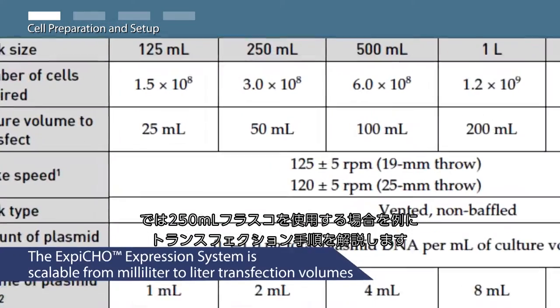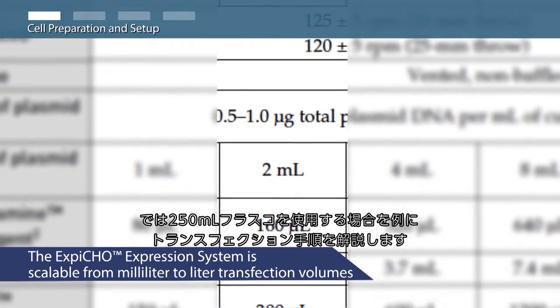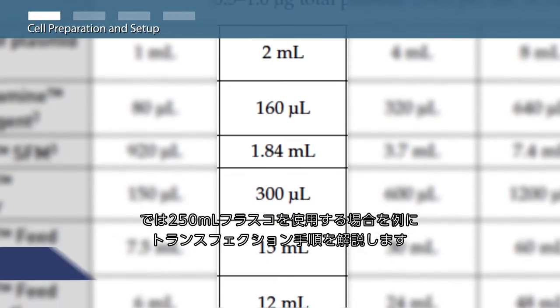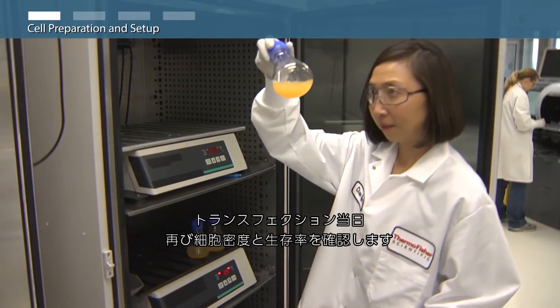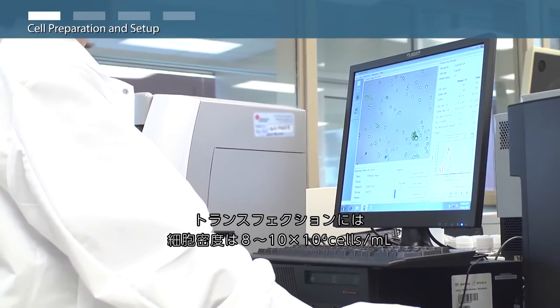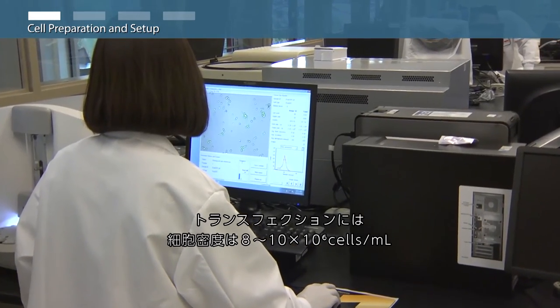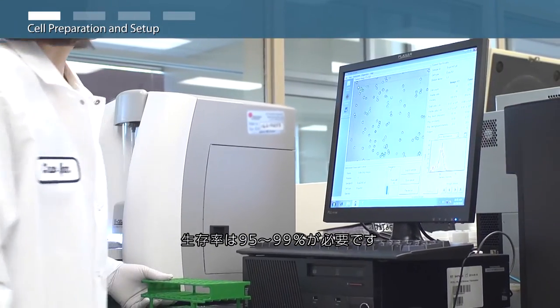We will follow the 250 milliliter flask format of the XBCHO expression system transfection protocol. On the day of transfection, reexamine cell density and viability. The cells should reach a density of 8 to 10 million viable cells per milliliter and viability should be 95 to 99 percent to proceed with transfection.